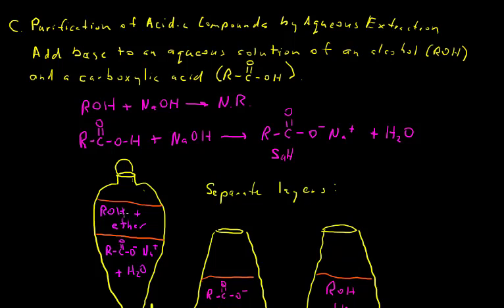You have to choose the proper organic solvent, of course, than they are in aqueous solution. So we're going to add this basic mixture of these 2 compounds, the aqueous solution of the 2 compounds, into our separatory funnel. We add our organic layer. In this case, I chose ether again, so it's on top. It's less dense than the aqueous solution.